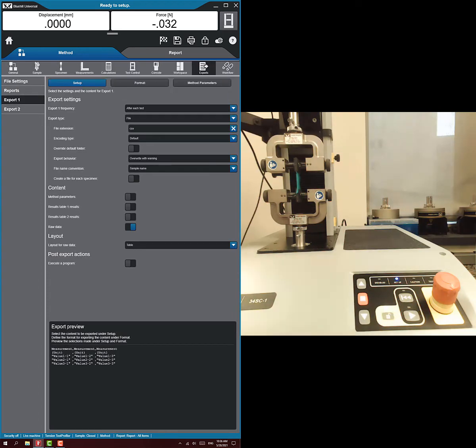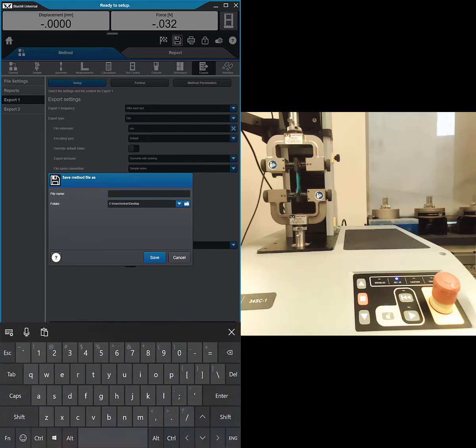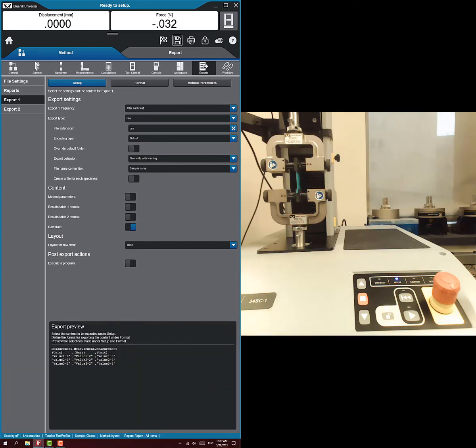Okay, and we're pretty much done. It's that easy to set up a hysteresis test. So I'm going to save the method. It wants a file name, which brings up the keyboard. I didn't spell it right, but I put it in there so I know what it is. Now we're done, I'm going to go back home and we're ready to run our test.